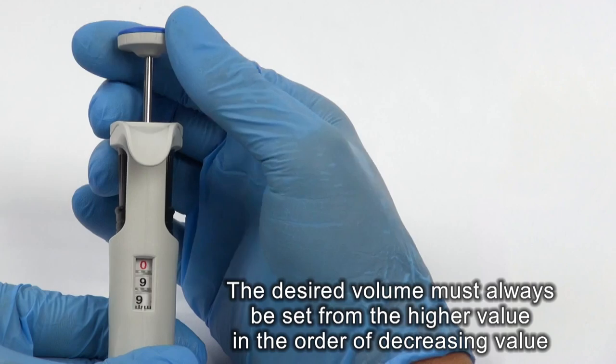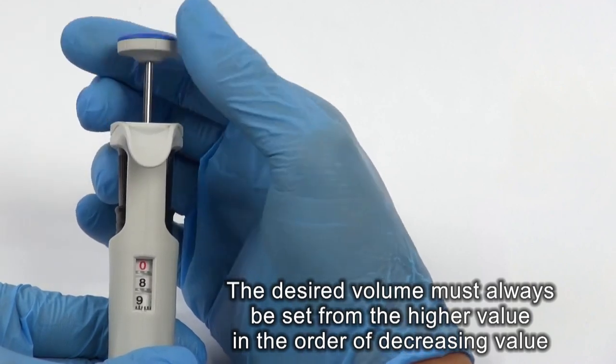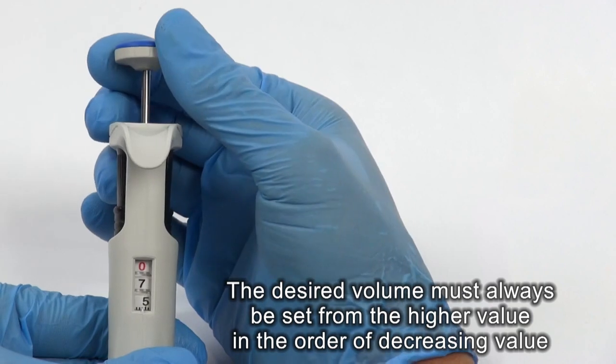If the desired volume is lower than the set volume shown by the counter, turn the counter in the direction diminishing counter readings to the required volume. Avoid passing this value.